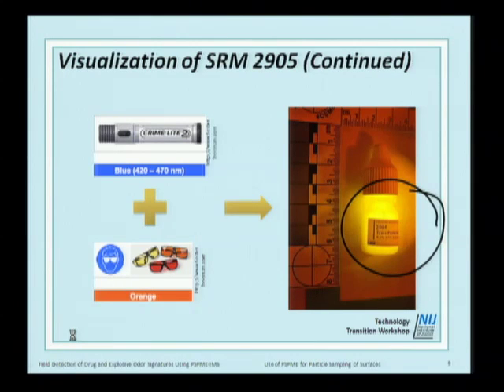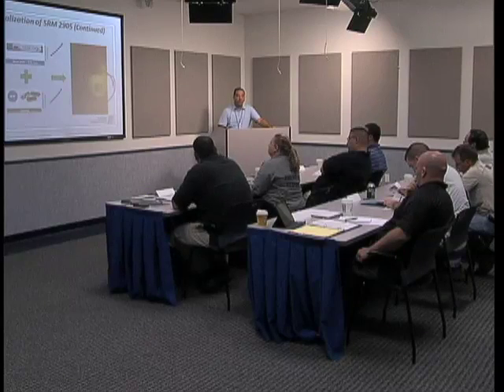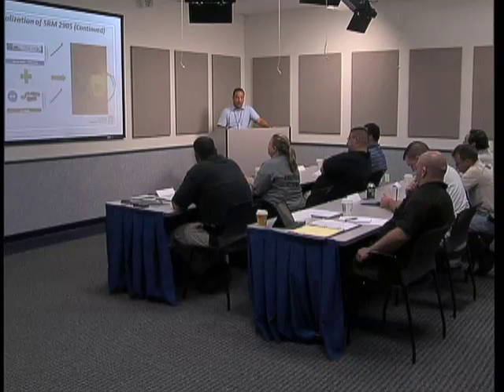That combination of adding the amber lens increases the contrast, so you're able to see the fluorescence better. So if you irradiate it with blue light, we have some blue light, we have some amber lenses for each of you, we're going to see this fluorescence, bright light being emitted, which is a different wavelength than the light that's being used to irradiate the sample. That's the definition of fluorescence.